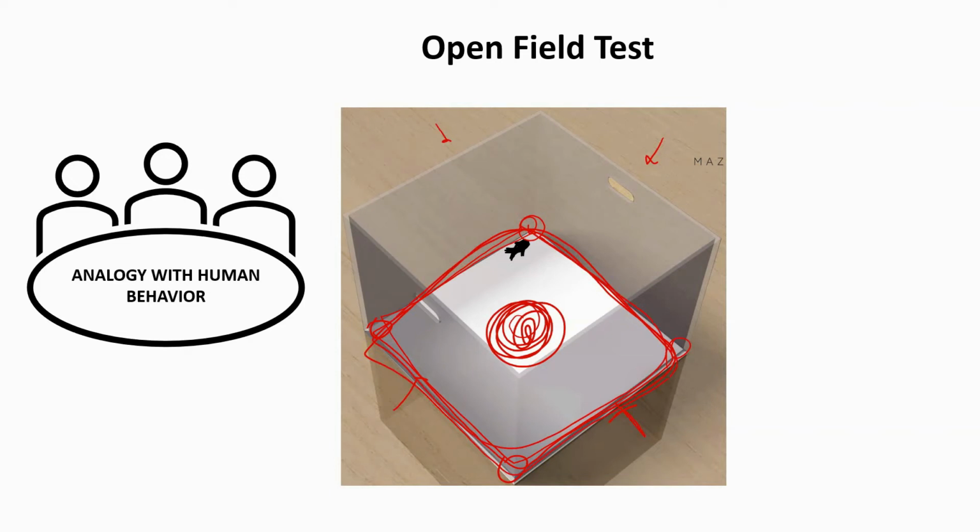First reason is, since our chamber is made up of glass, the fish is thinking that it might be able to cross it. Fish doesn't know it is glass, and fish doesn't know that they cannot cross it, but they will at least try, right? So what they do is, they come with full force and they butt their head on the glass, and this is called head butting. Head butting is also a feature of a very healthy normal fish. They try to escape. They butt their head on the walls of the apparatus, and this is how they show that they can actually see you.